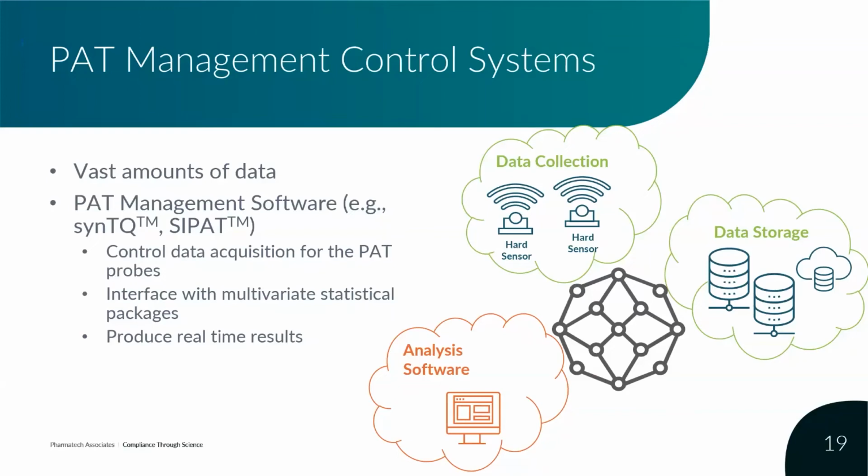A lot of times, if your control strategy requires data collection every 2 seconds, but the processing time takes 4 seconds, and that's not necessarily unusual, then you're going to need a different PAT tool or probe type. And often this can be discovered way too late, resulting in additional costs.